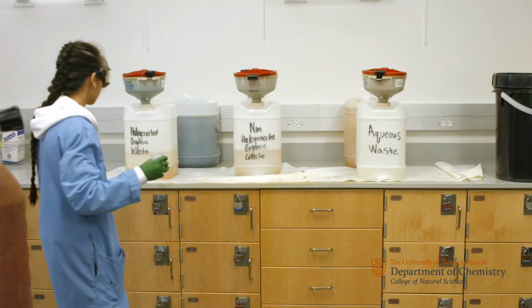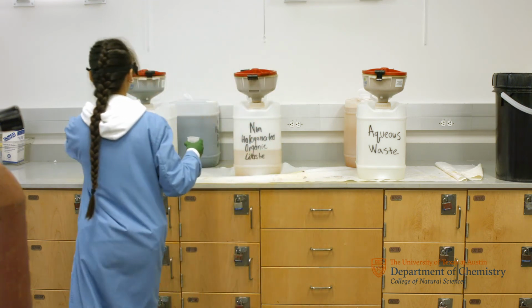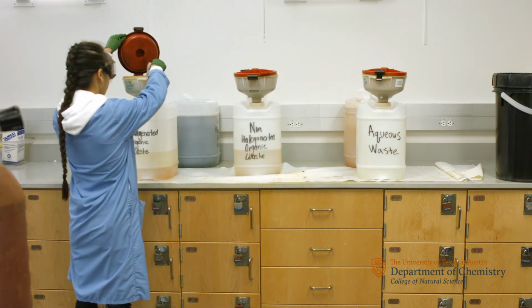Now take the waste beaker to the waste area and pour it into the correct liquid waste bottle, which in this case is halogenated organic waste.